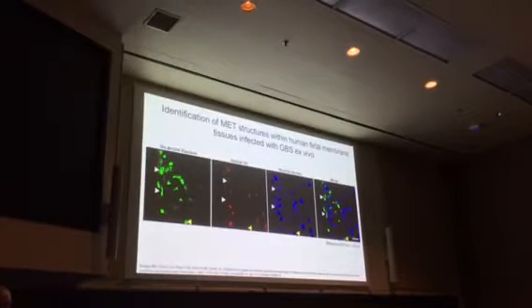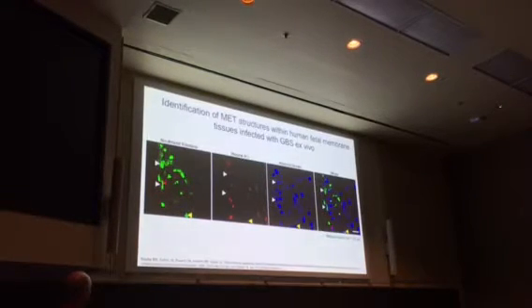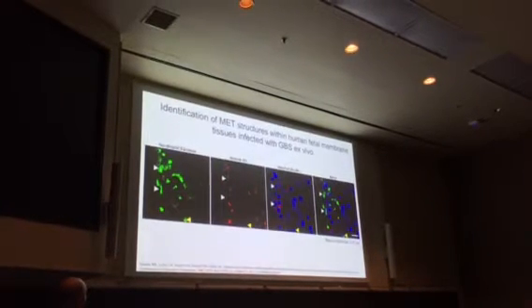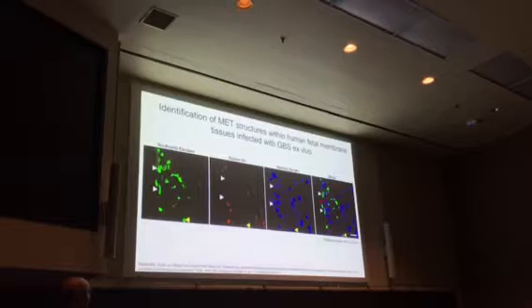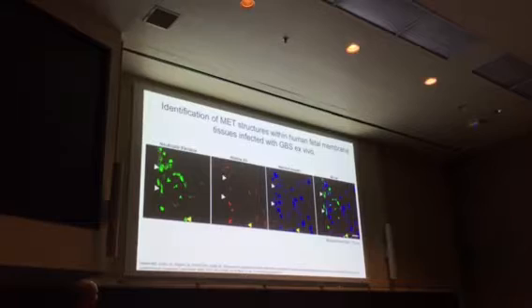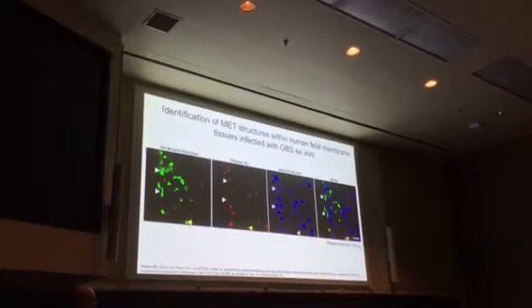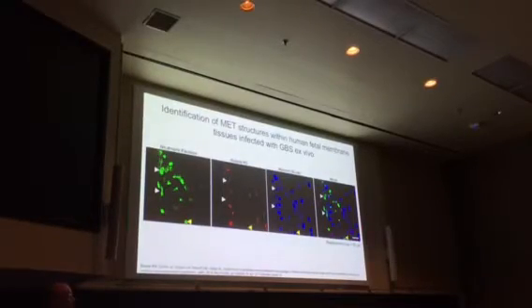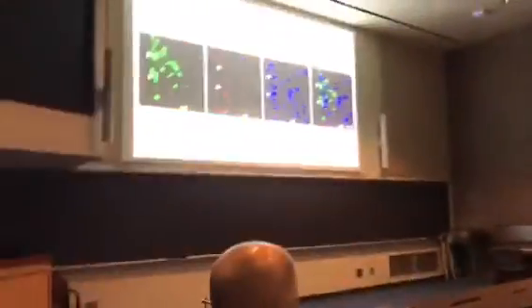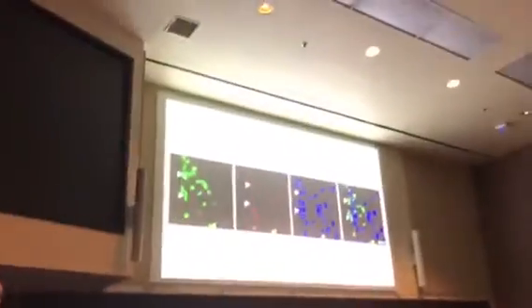If we look at this in more detail, you can see there are several cells releasing neutrophil elastase into the surrounding tissues that co-localize with histones as well as DNA, that nuclear stain. And when we merge them together, you can see that at the white arrows. Now, contrast this to what we see at the yellow arrow. We have a well-defined cell with well-defined granules and a well-defined nucleus. So this would be a normal macrophage that has not undergone the extracellular trap pathway to basically condense and mix all these contents together.